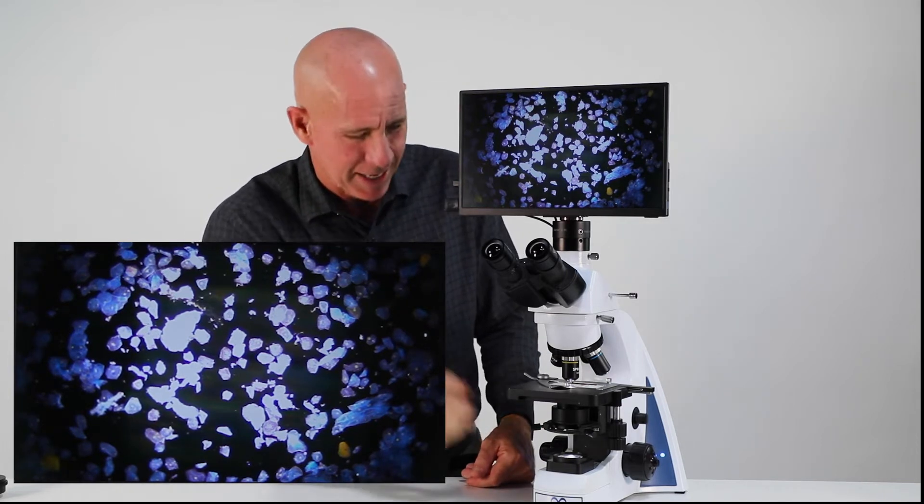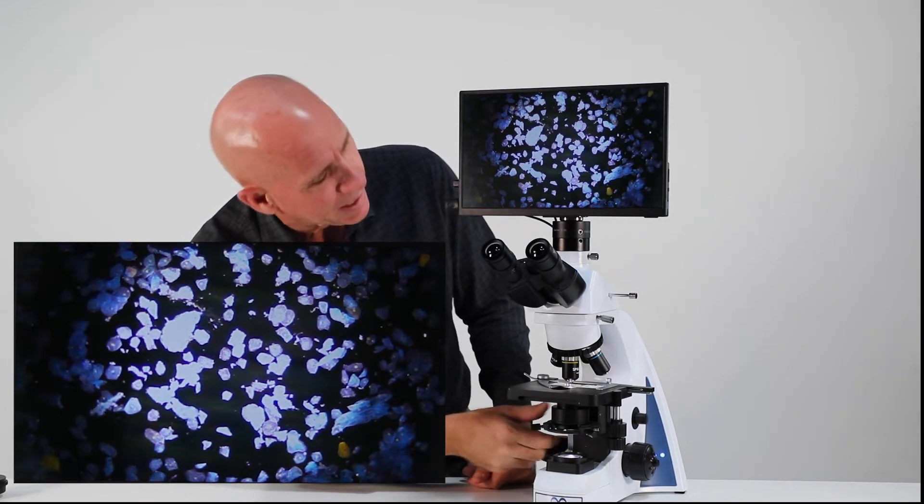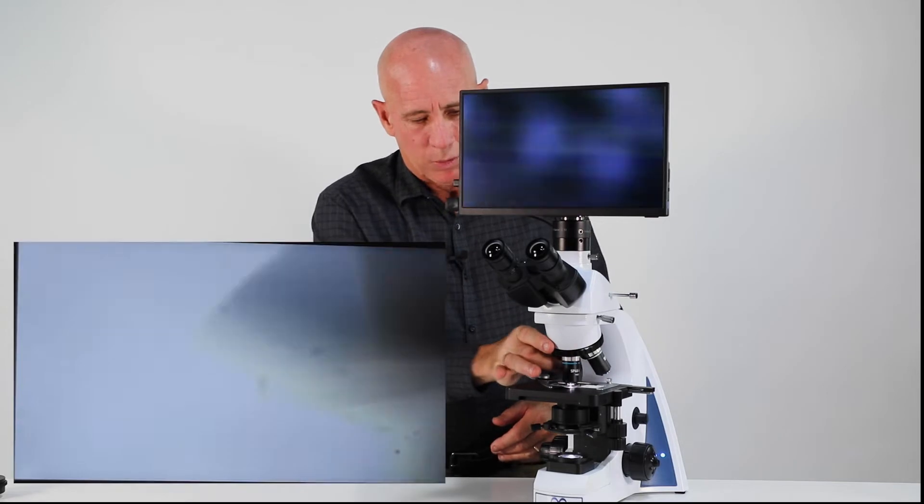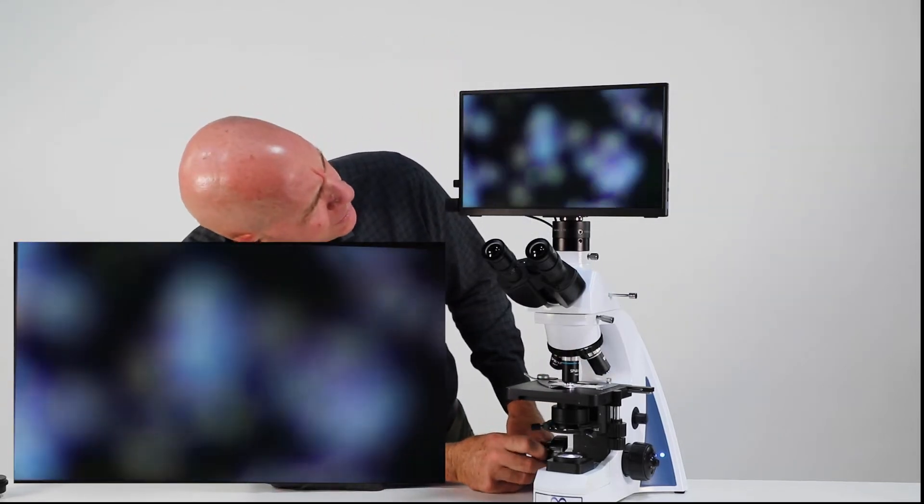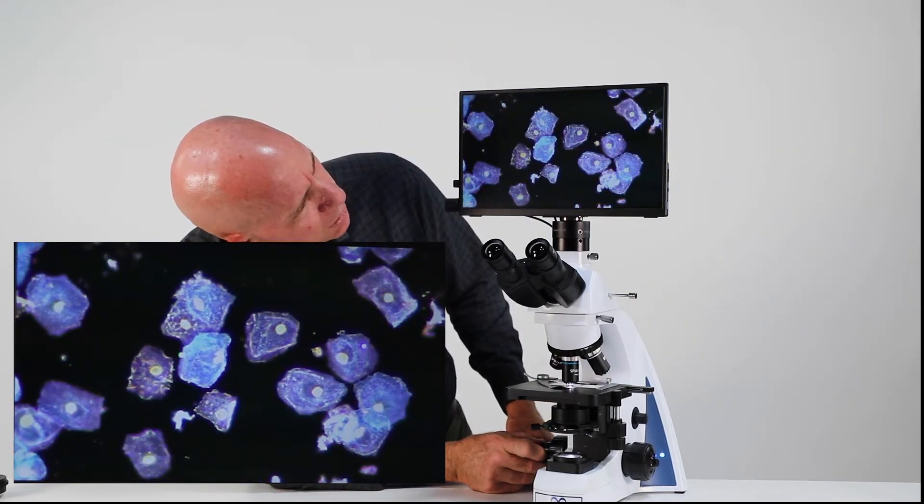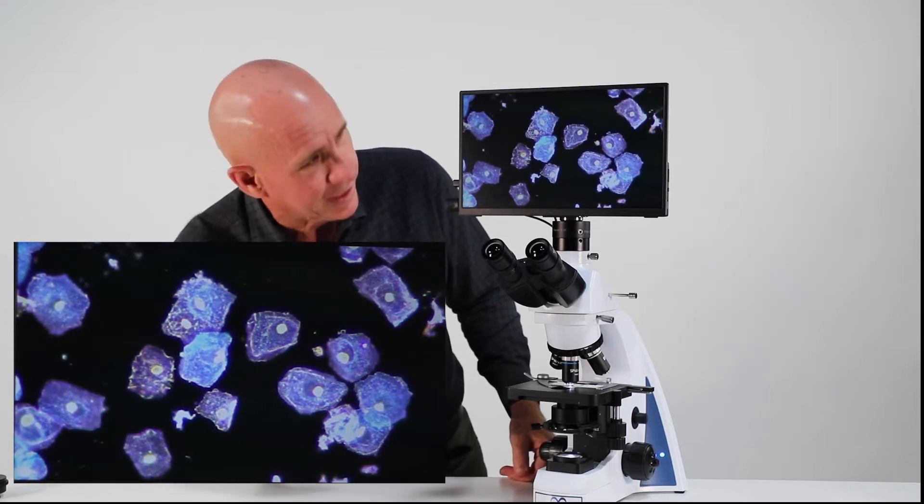You may be all the way up. You may come down just a hair and you'll find the best illumination there. Now we go to the 40X and this is where it's going to be really beautiful. These are epithelial cells here.